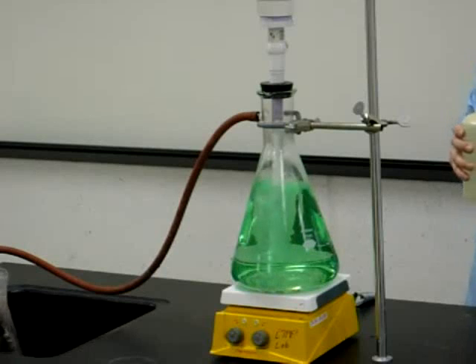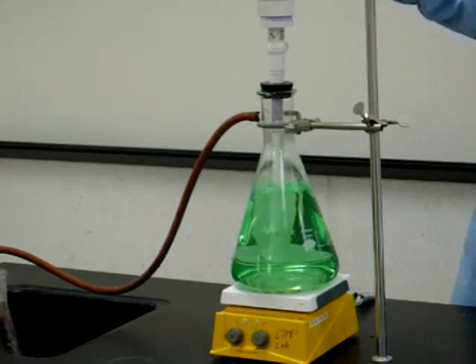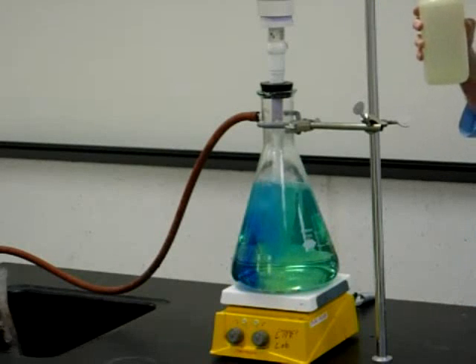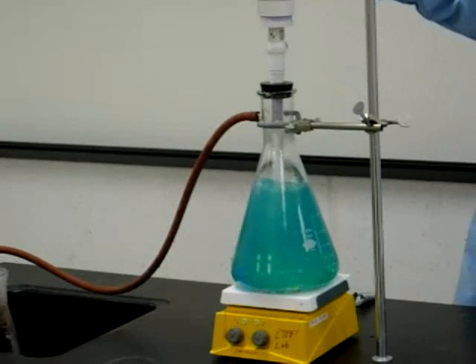If we then add additional ammonia, another form of copper will be produced, copper hydroxide. Copper hydroxide is insoluble in water, and so the solution becomes cloudy.